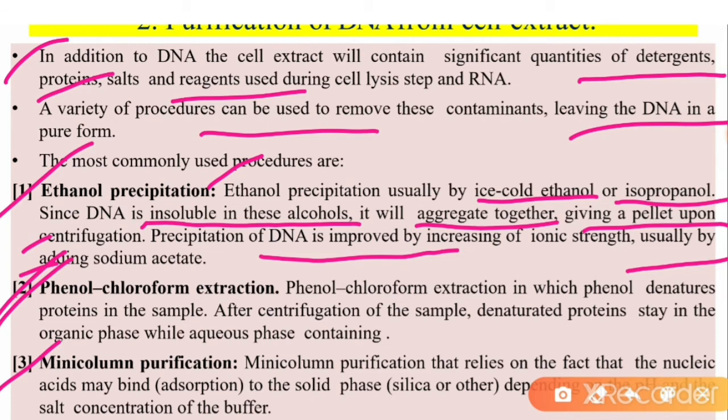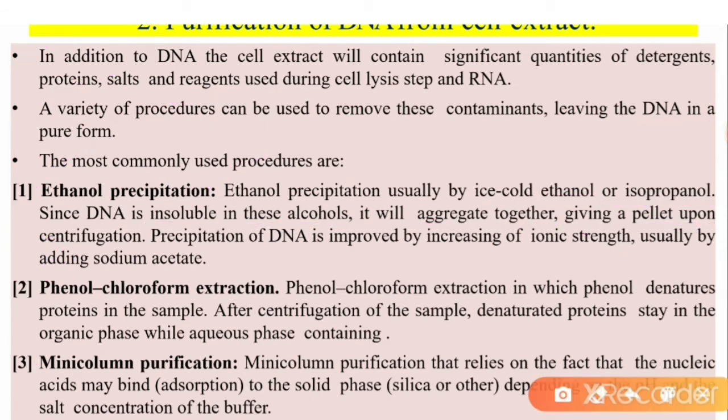The second method is phenol-chloroform extraction. In this method, phenol denatures proteins in the sample. After centrifugation of the sample, denatured proteins stay in the organic phase, while the aqueous phase contains the DNA.